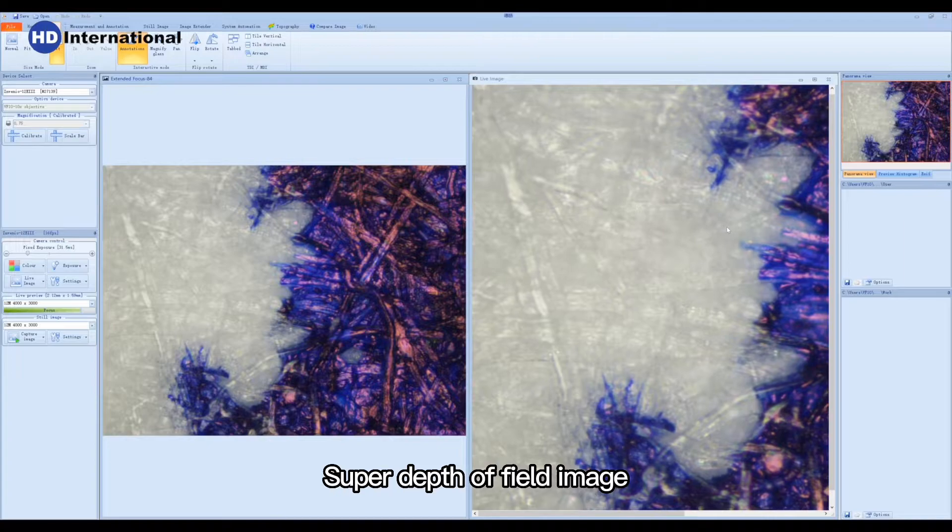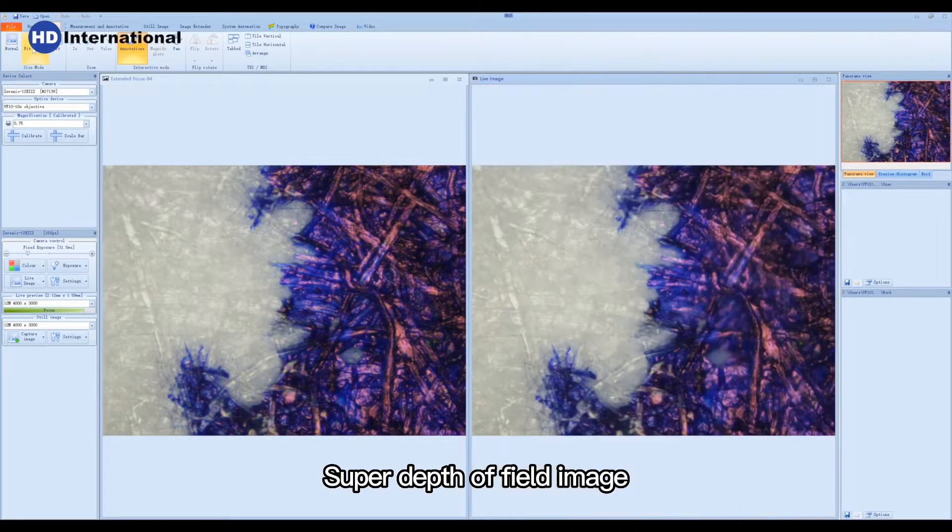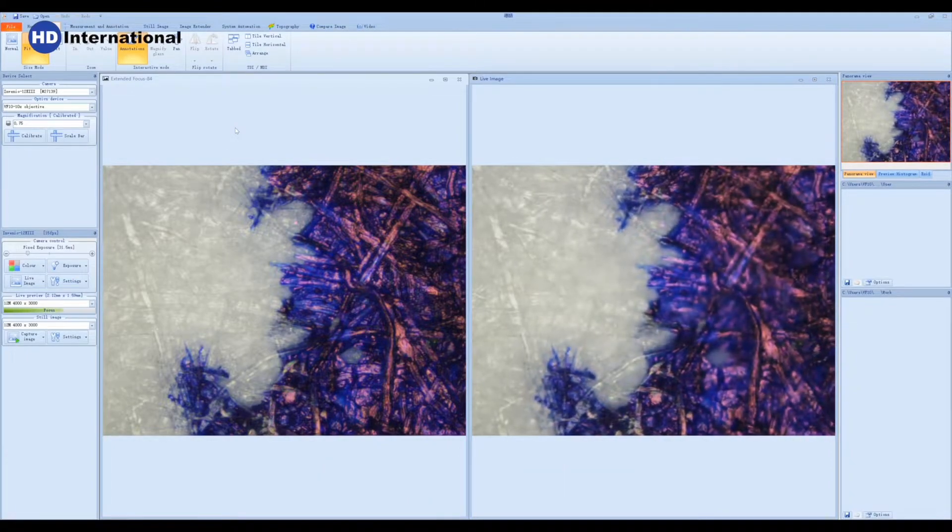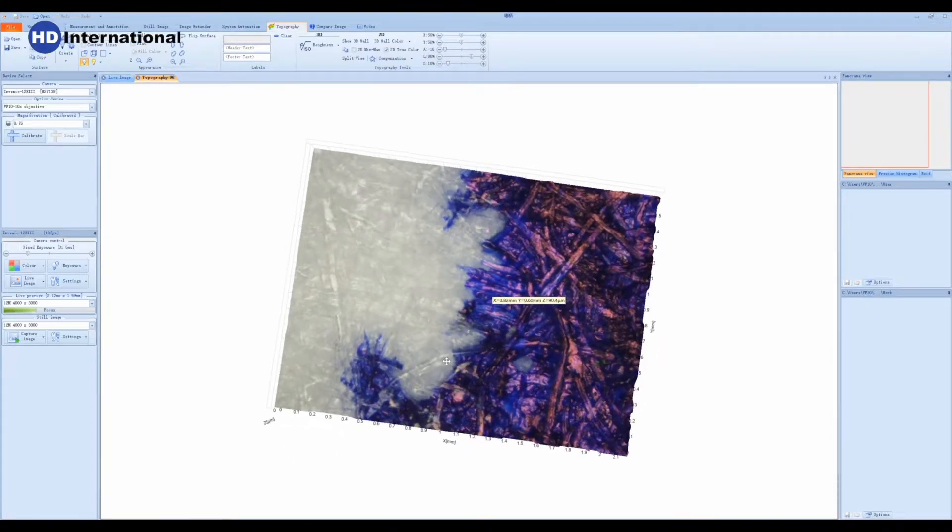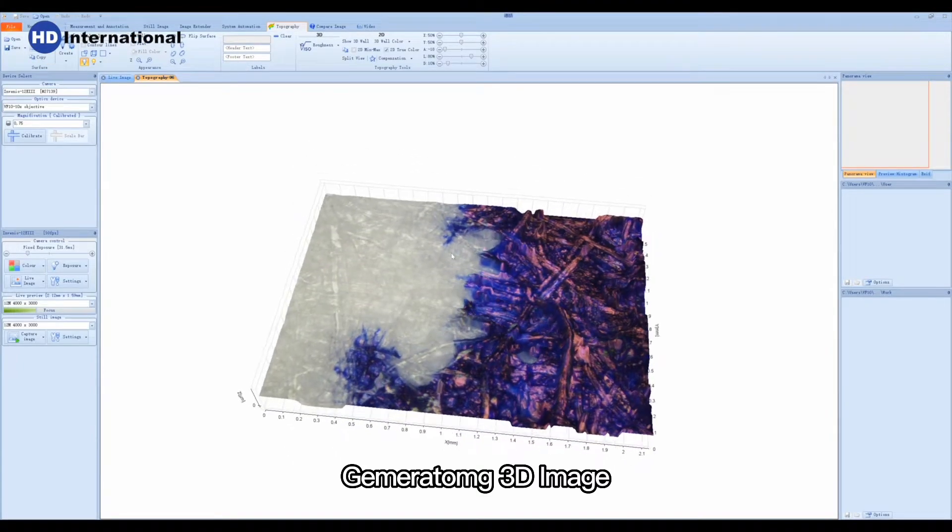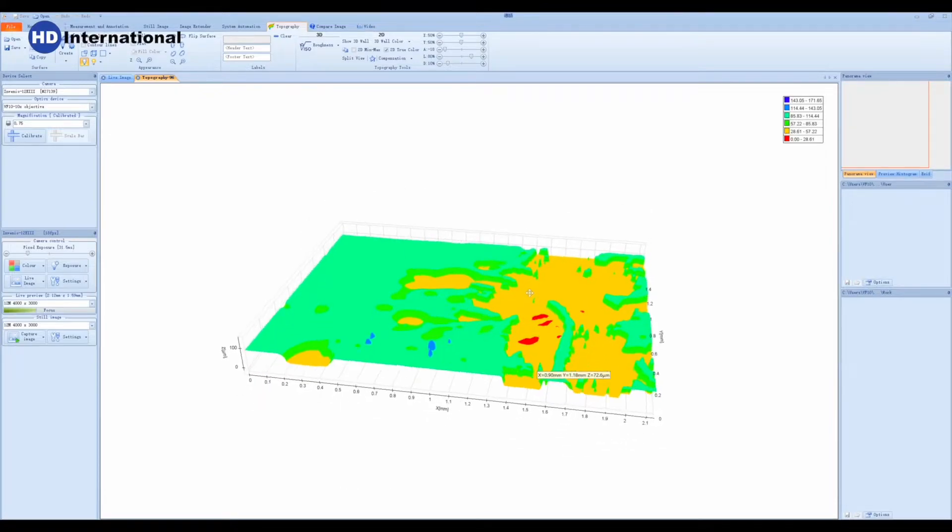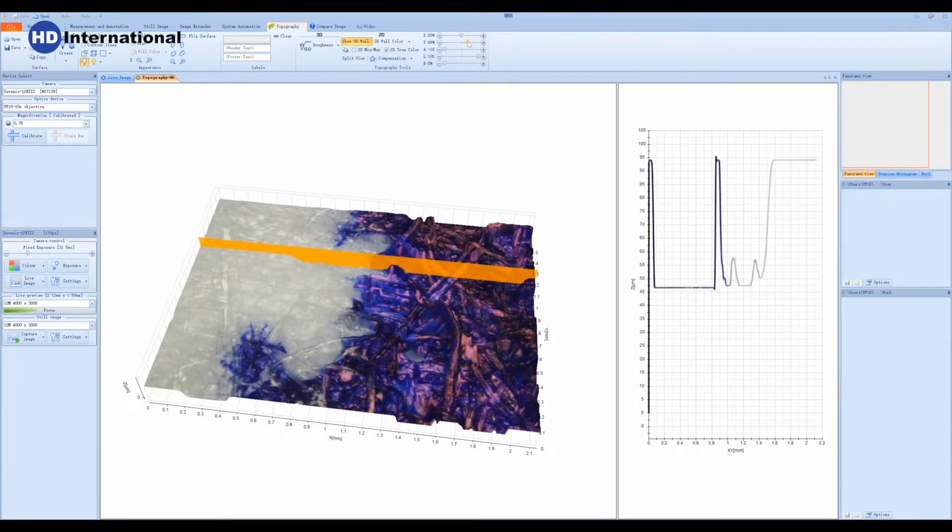Advanced capabilities include super depth of field imaging, generation of 3D images, and image processing systems.